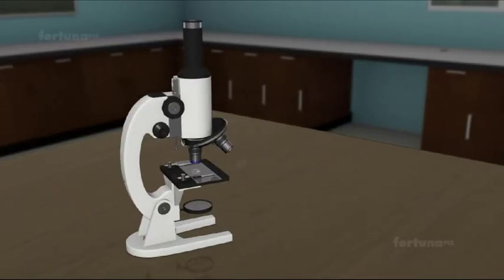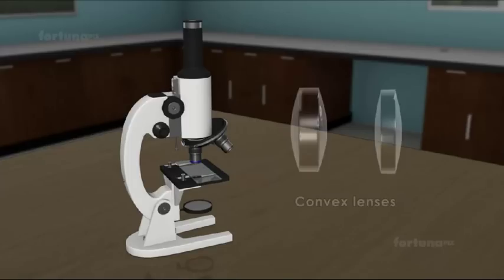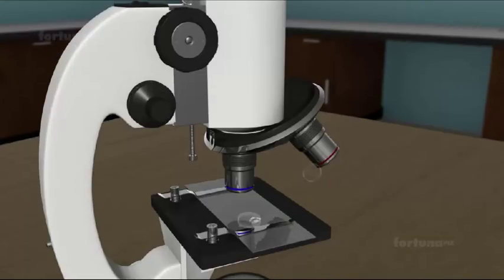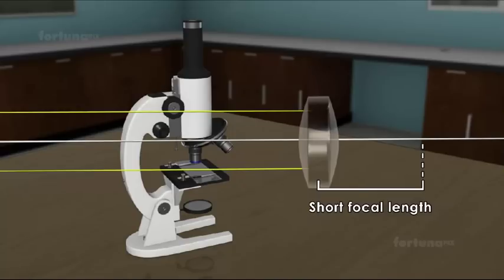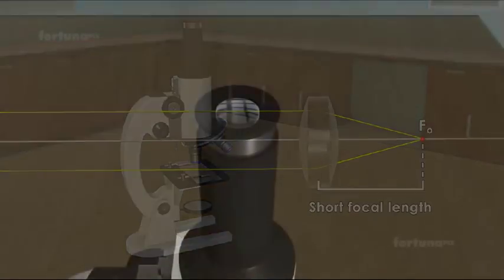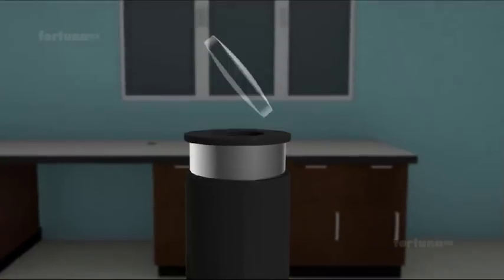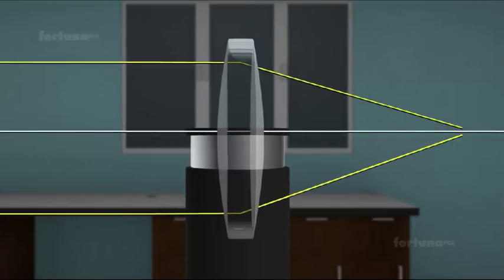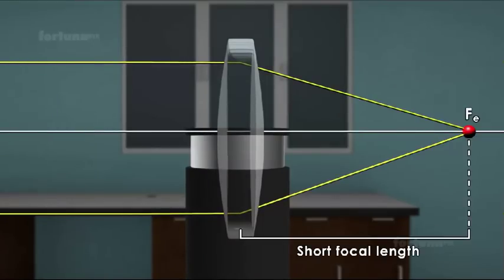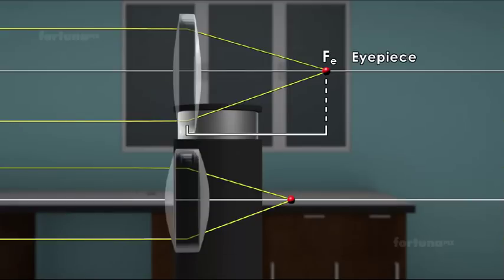The lenses are convex with different focal lengths. The lens closer to the object is the objective and has a short focal length, FO, usually below 1 cm. The lens nearer the eye is the eyepiece. Although the eyepiece also has a short focal length, FE, it is still greater than the focal length of the objective.